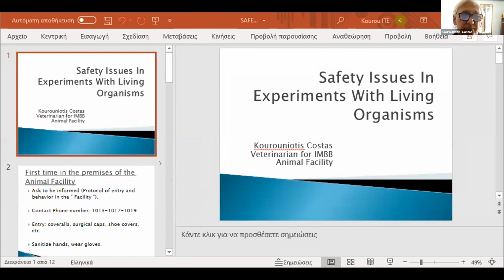Hello, I'm Kostas Kourouniotis. I'm the veterinarian from the IMBB Animal Facility. Today, we'll say some things about the safety issues in experiments with living organisms. It will be a short presentation because most of the things I could say have already been said by the previous speakers. Mostly we talk about the animal facility and mice because that's the organism we have in the animal facility.